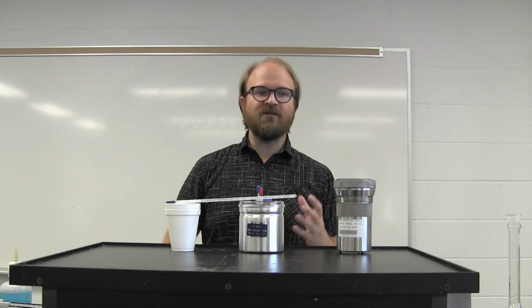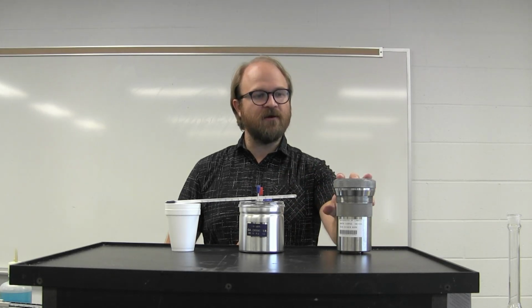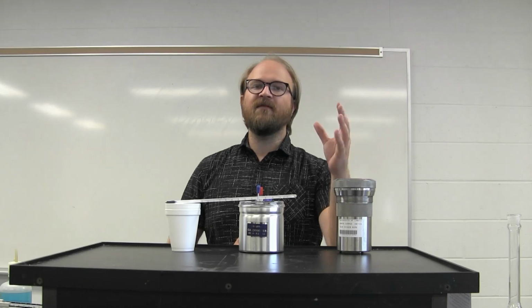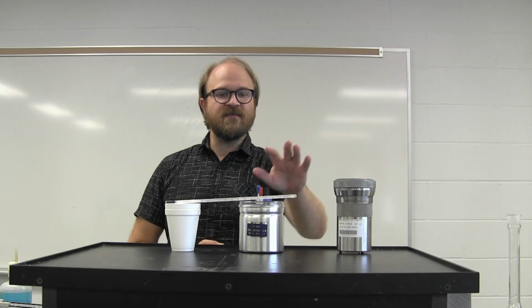This calorimeter is very heavy and the heat capacity is very large. All of the energy from a reaction inside this calorimeter is absorbed by the calorimeter itself, and the change in temperature is measured. As you get simpler and simpler, the calorimeters themselves still operate in that same way.